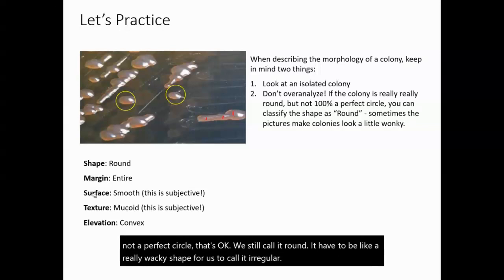All right, so now I asked about the margin. Remember, we're only looking at the edge here. Do you notice that the edge is a nice, smooth, straight line? I'm going to kind of trace it. It's a nice, continuous, straight line, so it's entire.